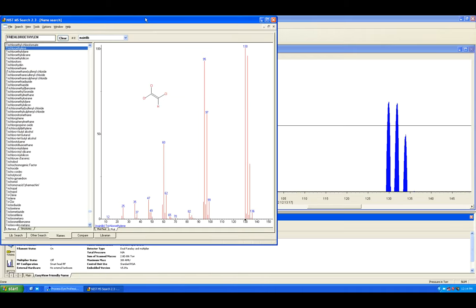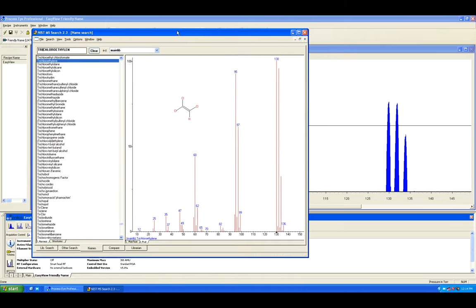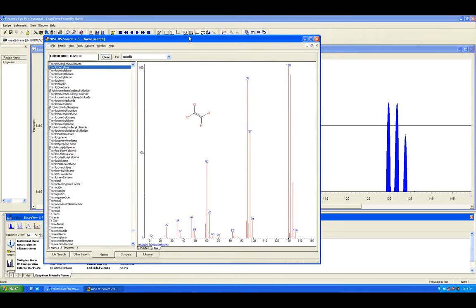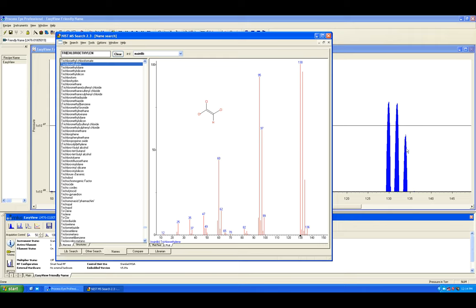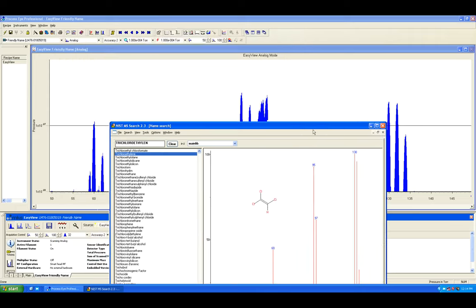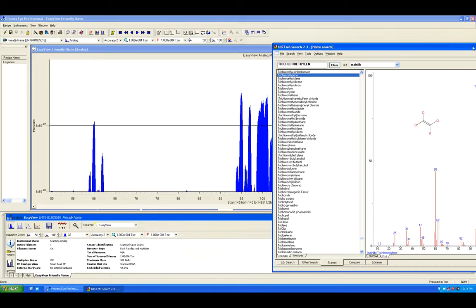Chlorine has two main isotopes, chlorine-35 and chlorine-37, at 75 and 25 percent respectively, and always shows up in pairs at that ratio on the spectrum, which makes its identification easy. For example, here's trichloroethylene with additional peaks. The same ratio, two AMU apart, can be seen as long as you use a linear scale.